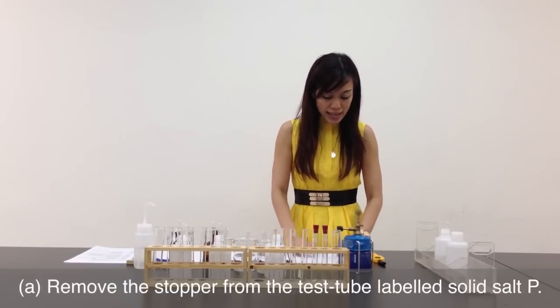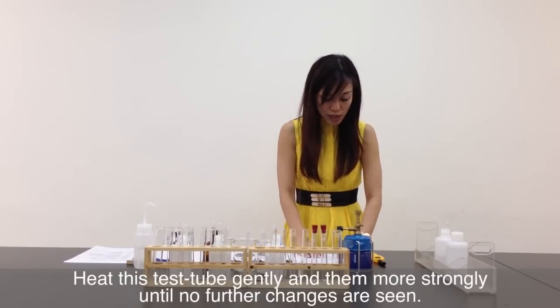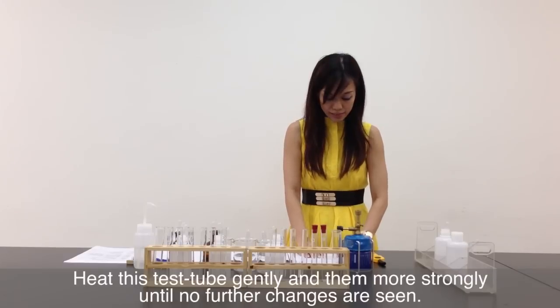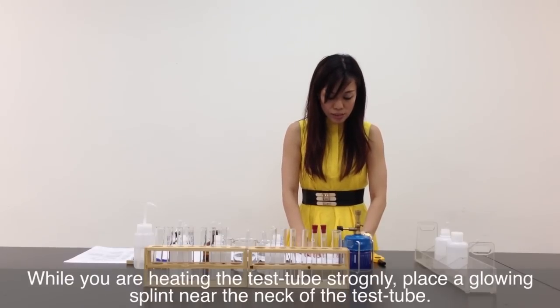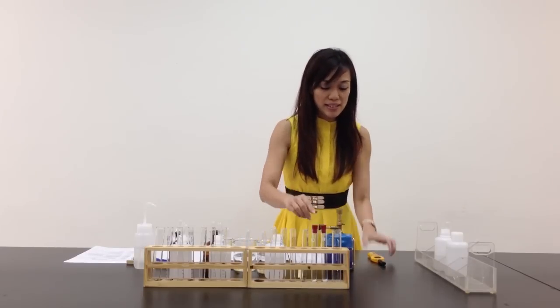Now, Part A says: remove the stopper from the test tube labelled solid P. Heat this test tube gently and then more strongly until no further changes are seen. While you are heating the test tube strongly, place a glowing splint near the neck of the test tube. Before I start heating, let's test the Bunsen burner.